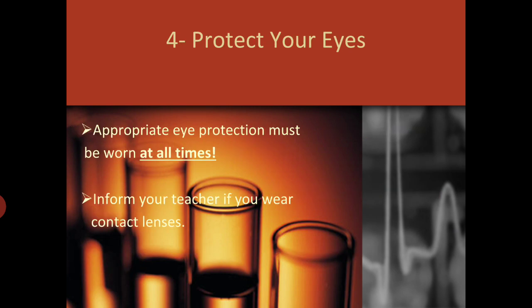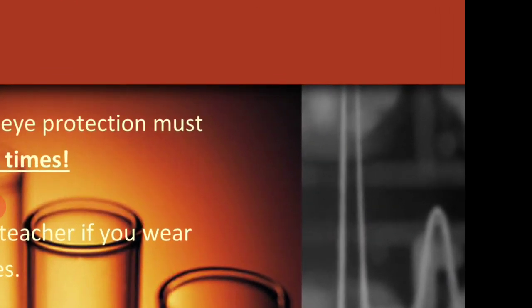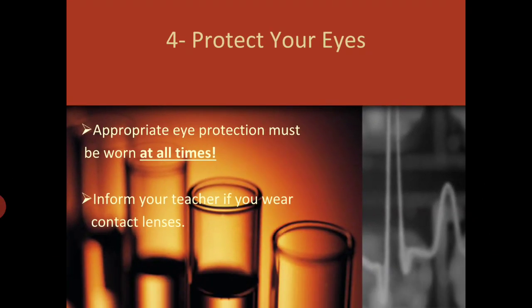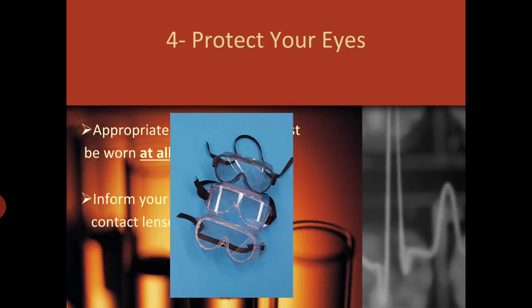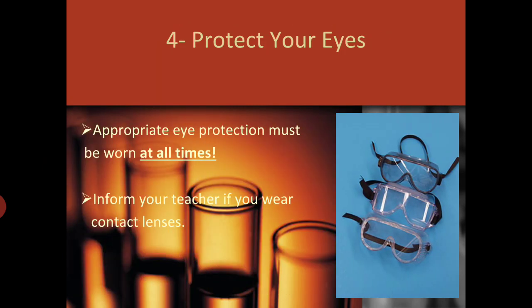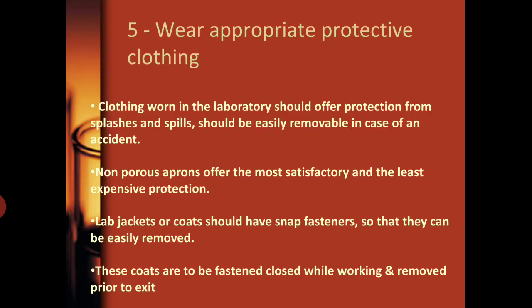Coming to eye protection, wear the appropriate eye protective goggles in the laboratory and inform your teacher if you are wearing any contact lenses. These are the protective goggles which we are supposed to wear all the time while working in the laboratory.